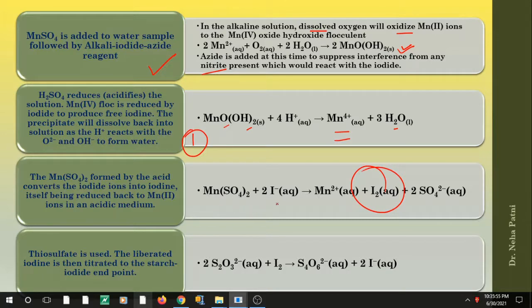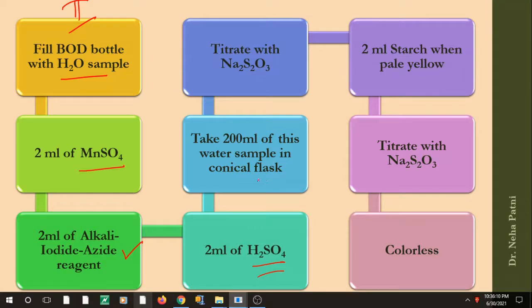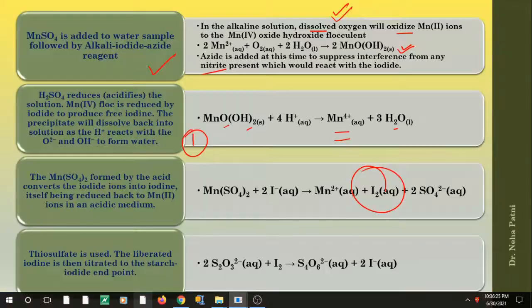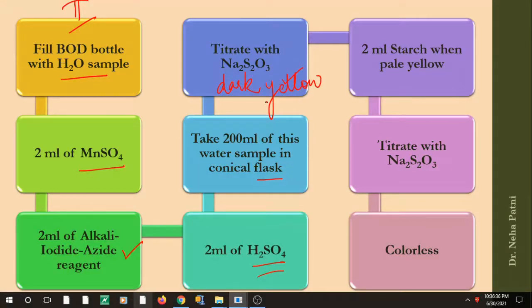The second role of the acid is to liberate free iodine. Once Mn⁴⁺ reacts with iodide ions, it releases iodine. The liberated iodine is proportional to the amount of oxygen present in the sample. You then transfer this to a conical flask and titrate with sodium thiosulfate. The amount of sodium thiosulfate used to titrate the liberated iodine tells you how much oxygen was dissolved in the water sample.